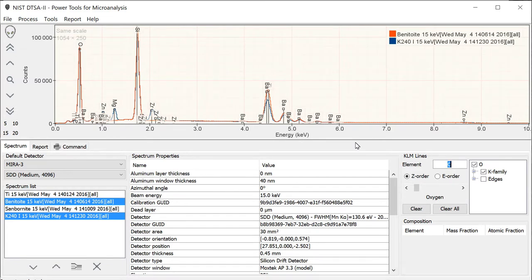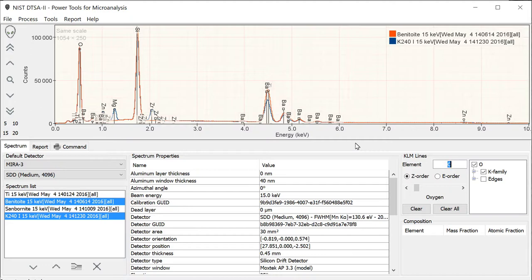Hello and welcome back. This is another in the series of videos on using NIST DTSA2, and this one I'm going to go ahead and try and explain what peak shape references are and why they're necessary.